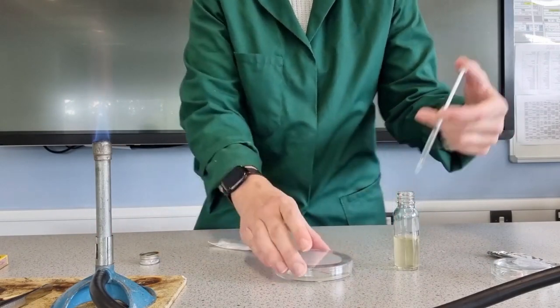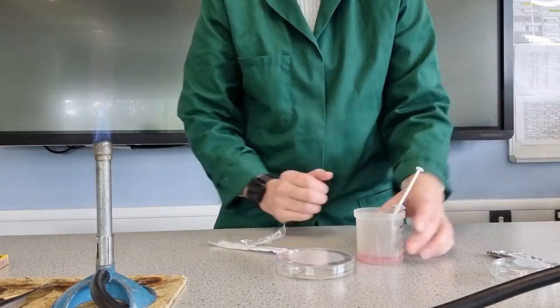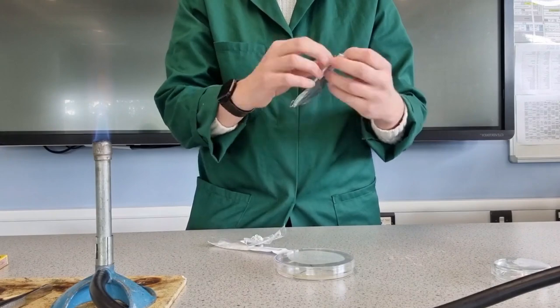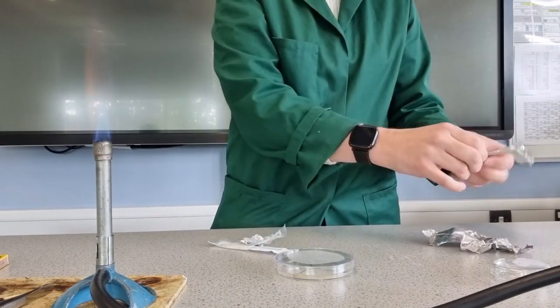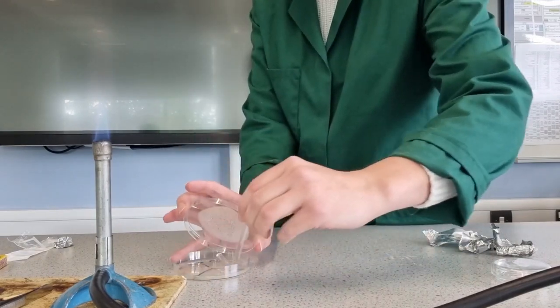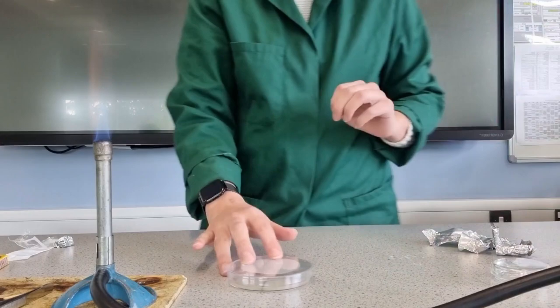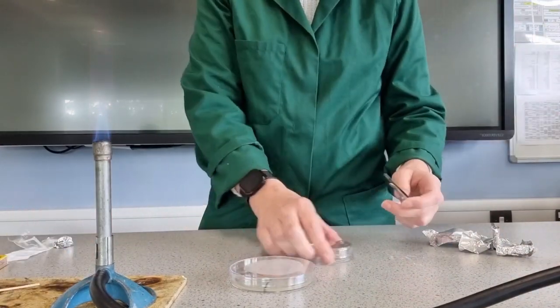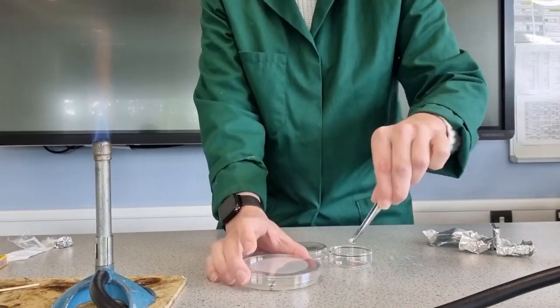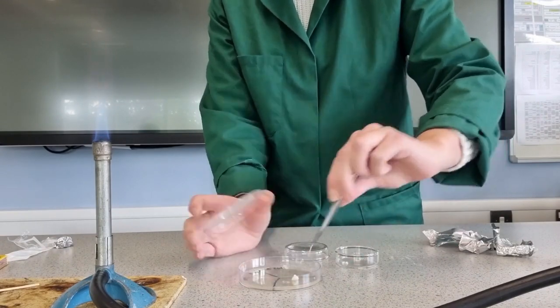Now we're going to put on the bacteria, and straight away we are sterilizing the syringe. I've now got a sterile spreader and I'm spreading it evenly all over the plate. I'm working near the Bunsen burner where the sterile air is. Next then we're using sterile forceps to put our three antimicrobials on in the three positions that we've already sectioned out on the petri dish.